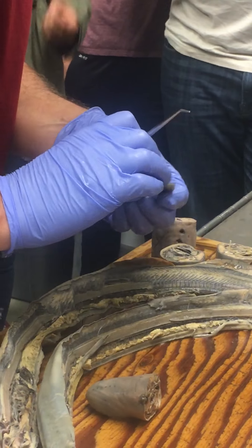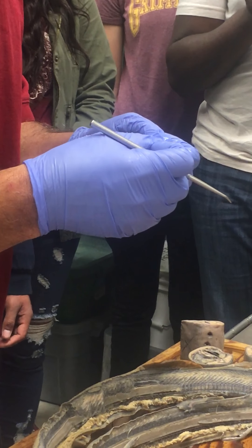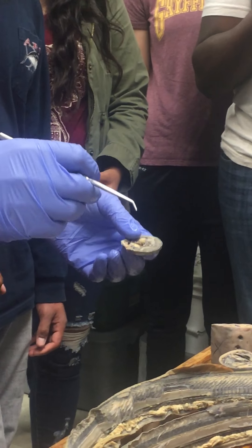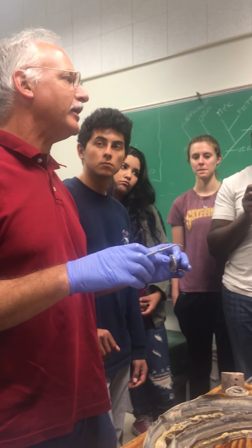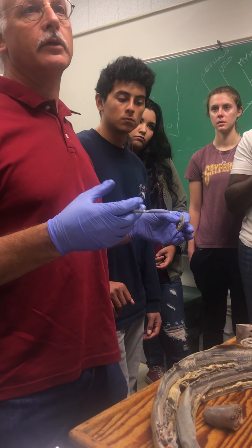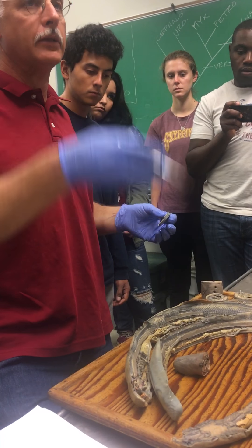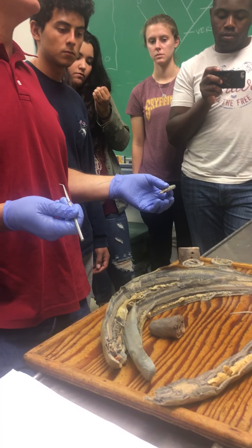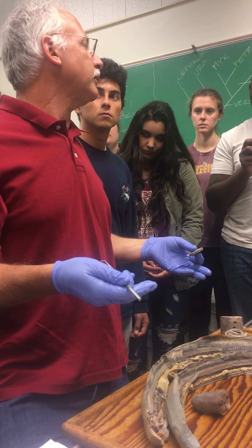The inner ear — right behind the eyes on either side of the brain you'll see these little mouse-ear-like structures sticking off to the side from the brain. That's the otic capsule, the part of the skull that holds the inner ear, with the inner ear inside of it. These guys don't have an external ear, but they do have an inner ear so they have a sense of balance, and they can have some sound perception, but not really well developed.